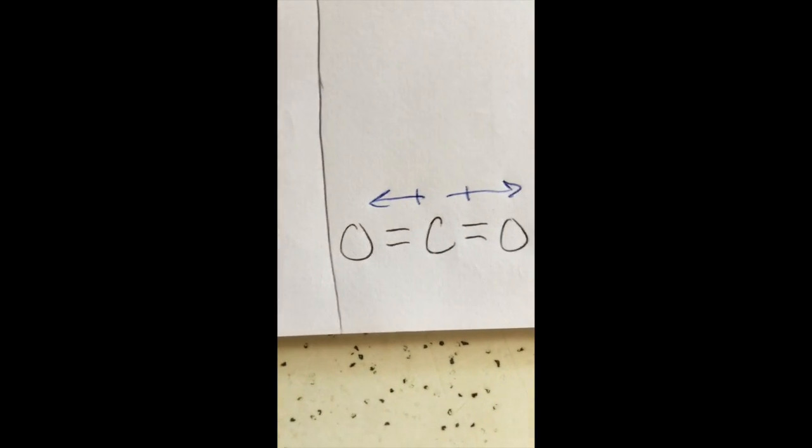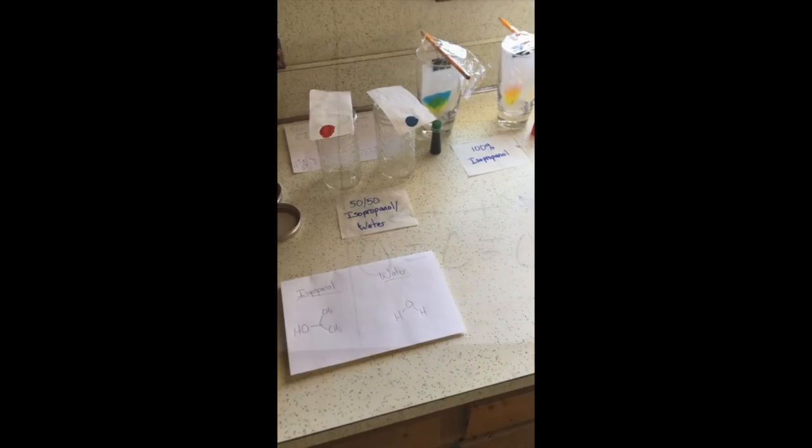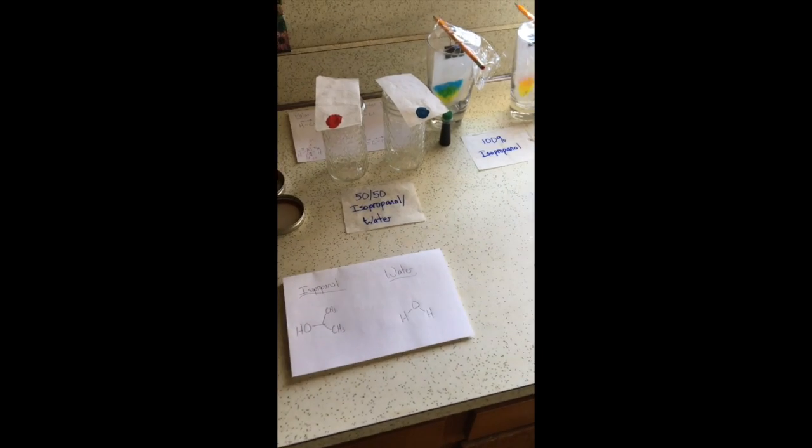And then CO2, carbon dioxide. Welcome back. So to explain chromatography and what it is, it has two components.